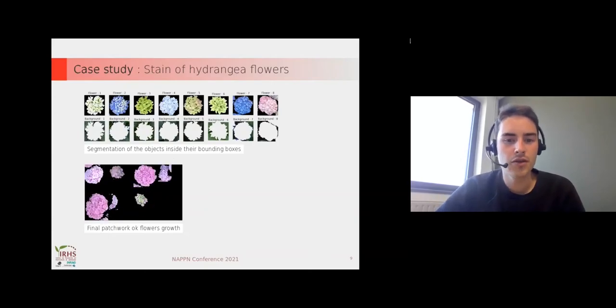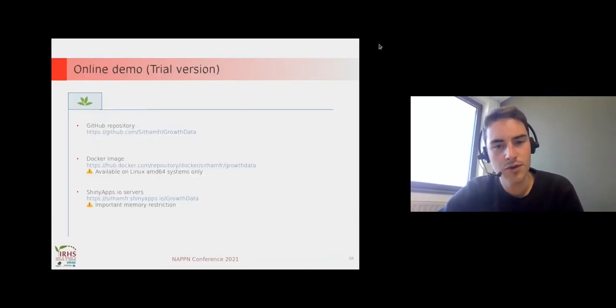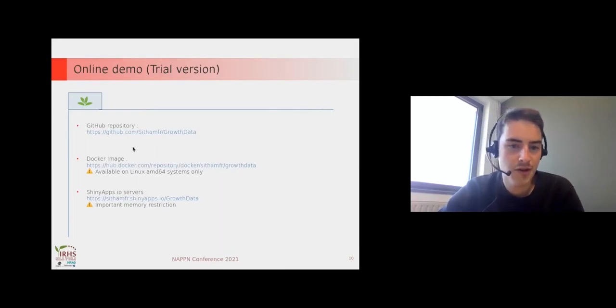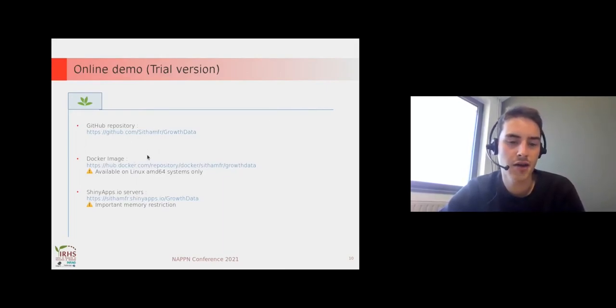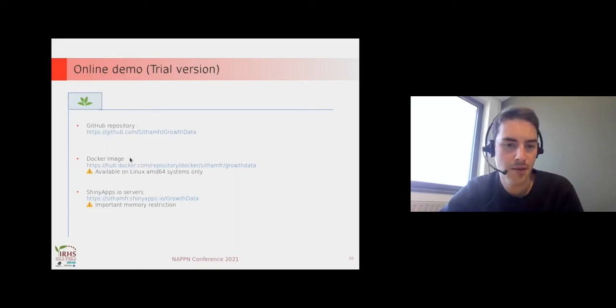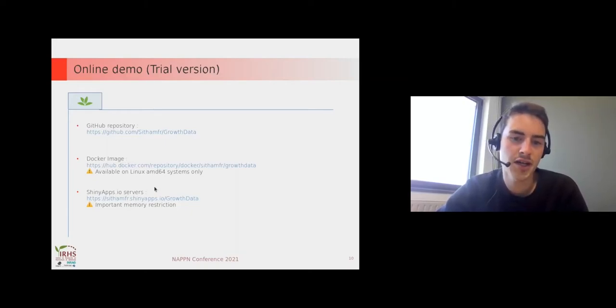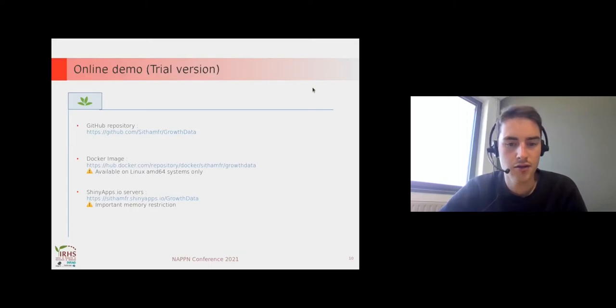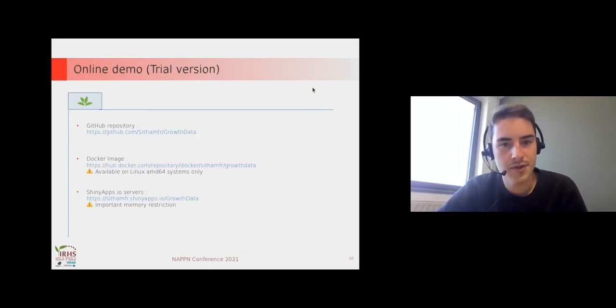Let's go for the demo. If you want more information you can go to the GitHub repository, and if you want to try the online demo of the app you have the Docker image and shinyapps.io servers which allow you to use it online.